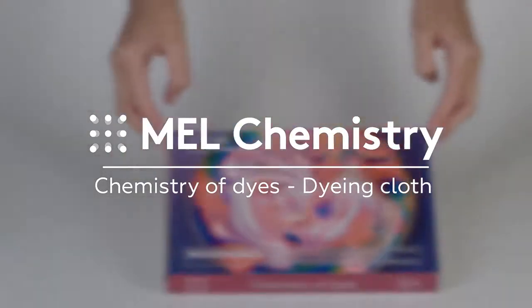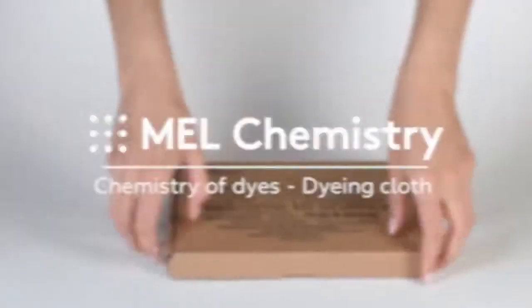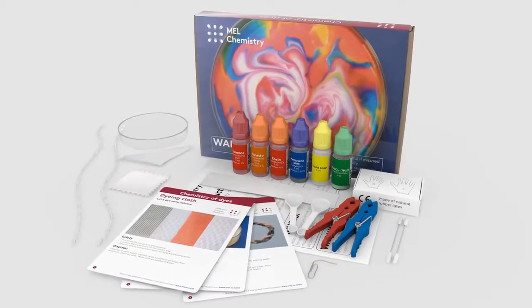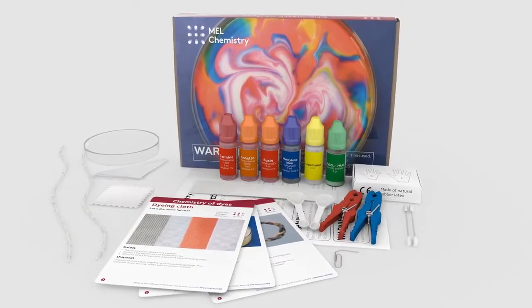Welcome to the wonderful world of chemistry. Today, with the chemistry of dyes set by Mel Chemistry, we will learn how coloring interacts with different fabrics.